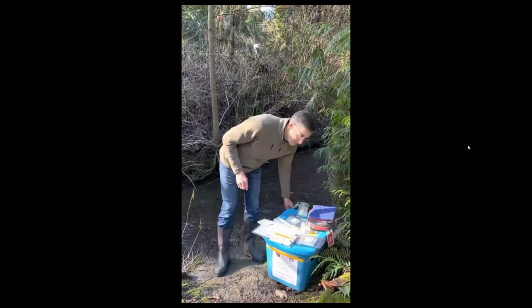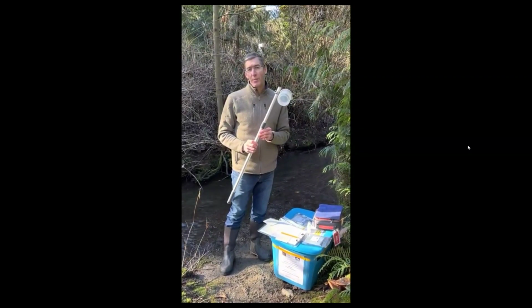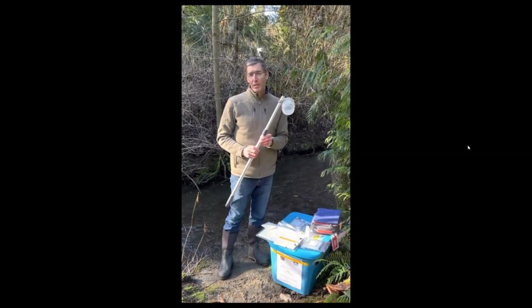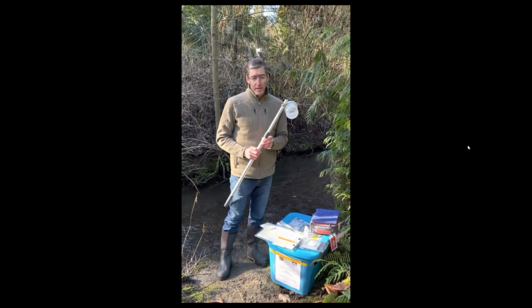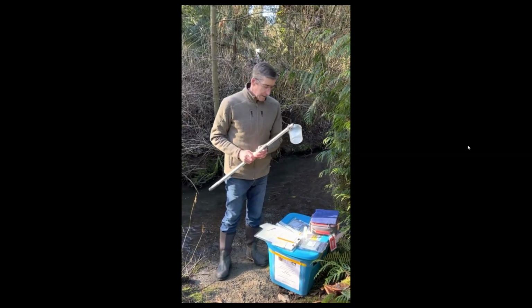And then some programs use a dipper, and so they collect their sample with a dipper, and then they pipette out of the dipper. So I'm going to demonstrate collecting a sample with each of these methods, and then how we plate the sample onto the R card, so you can see how that goes.